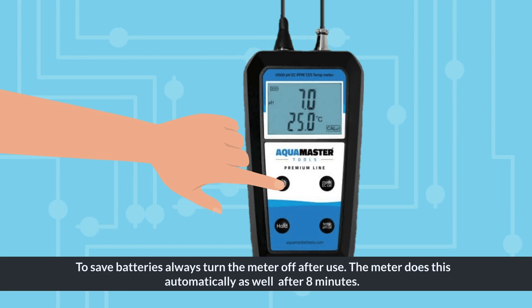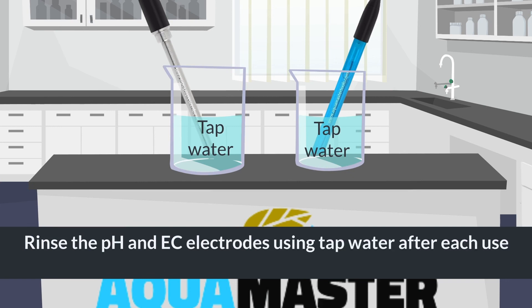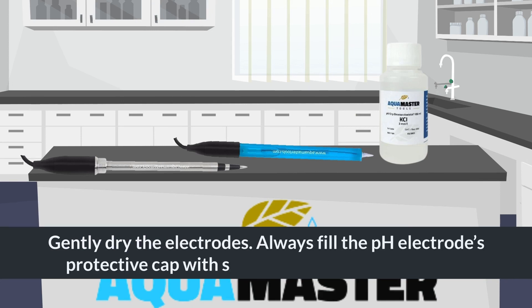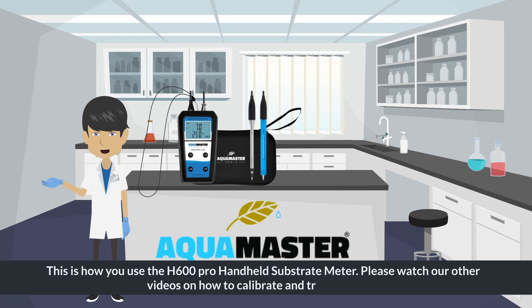To save batteries, always turn the meter off after use. The meter also does this automatically after eight minutes. Rinse the pH and EC electrodes using tap water after each use to minimize contamination. Gently dry the electrodes, and always fill the pH electrode's protective cap with storage solution and replace it.